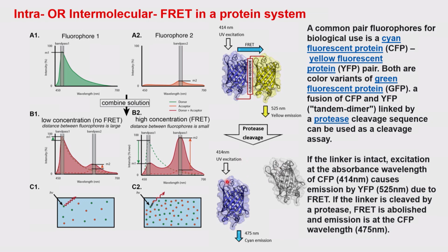So once you break, what happens? The bluish, cyan portion has come, and this portion has come without this color. That means no emission is coming. So this is not able to communicate whatever the outcome to this. So the outcome is 475, not 525. That means if this unit were not there, it will emit at 475. When the unit is coupled, it will give 525. So that is where you have seen.